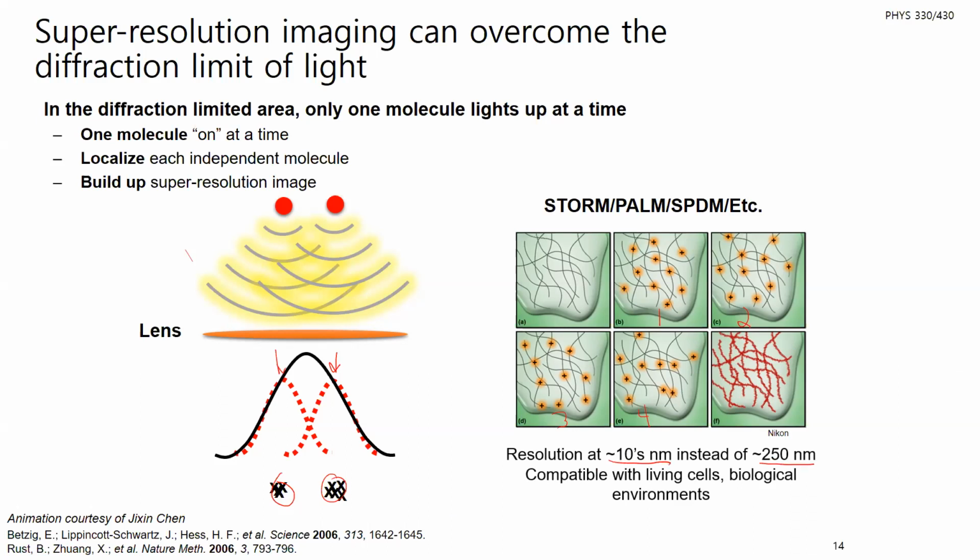If you think back to problem set 1, where you were looking at different organelles and different suborganelle organization, this is at the length scale of what's taking place in the cell. This would be too large. So that's the benefit of super resolution imaging, and that's why it also won the 2014 Nobel Prize in chemistry, because of how it's been applied to cellular imaging.